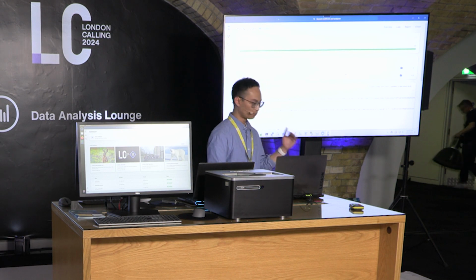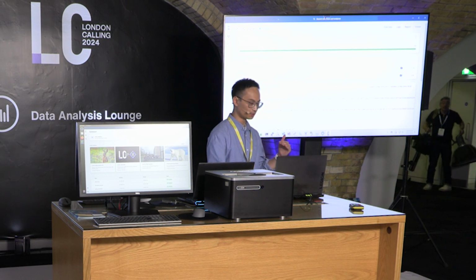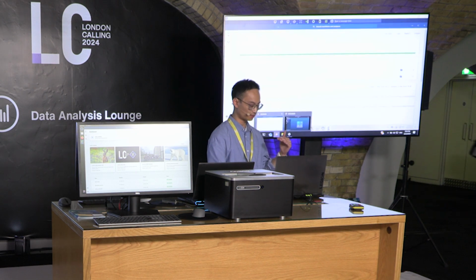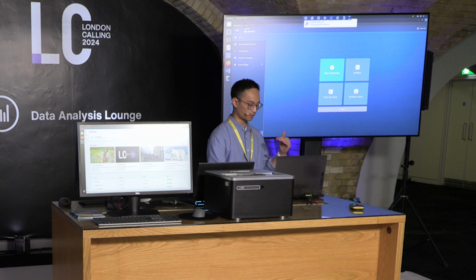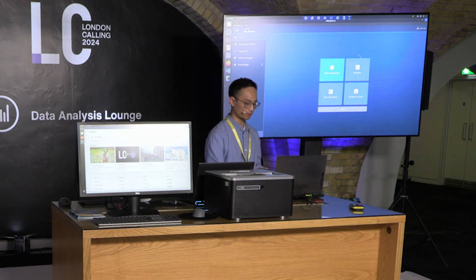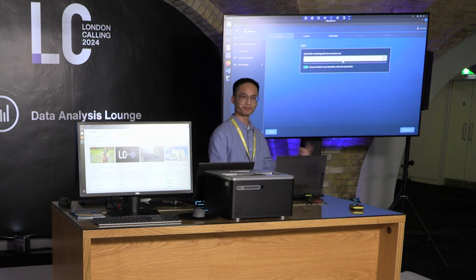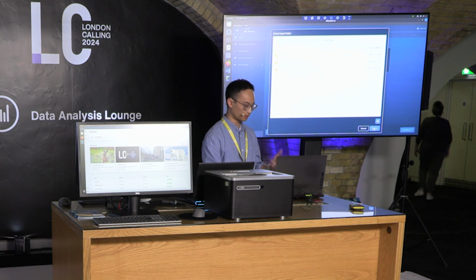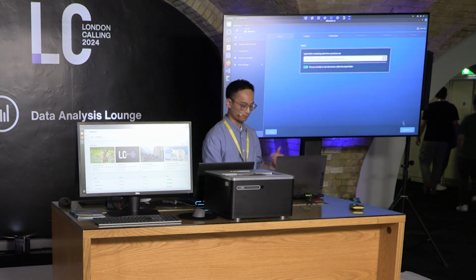And now this is where we shift over to our GridION, where we're going to do some base calling. So let me just exit out of this screen and go to our GridION here. We're going to do base calling in the MinKNOW app. So I'm going to click analysis, and we're going to do base calling on some FAST5 data that we previously generated. That's also in the LC demo folder. And we've got some FAST5 data here, which contains 3 barcodes. And we're going to click continue.